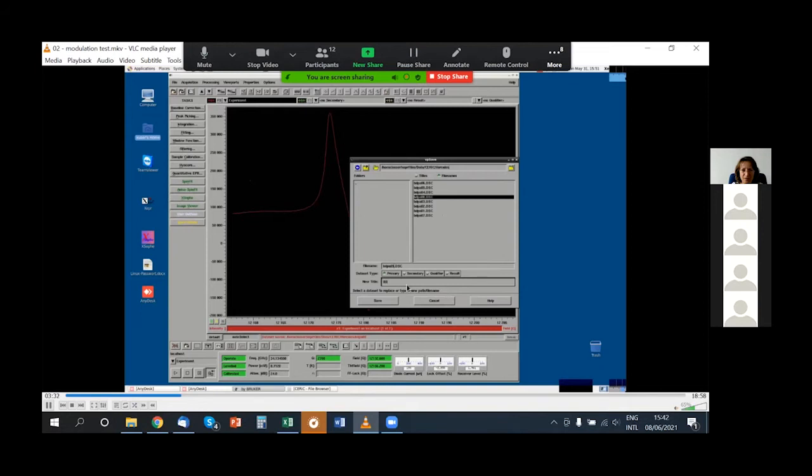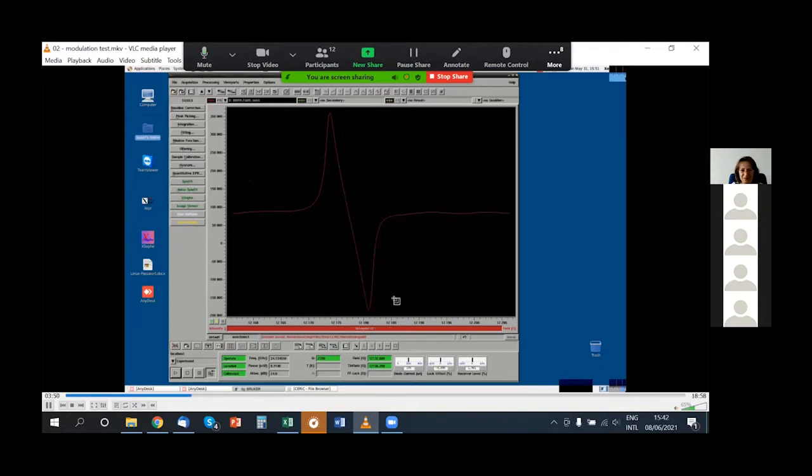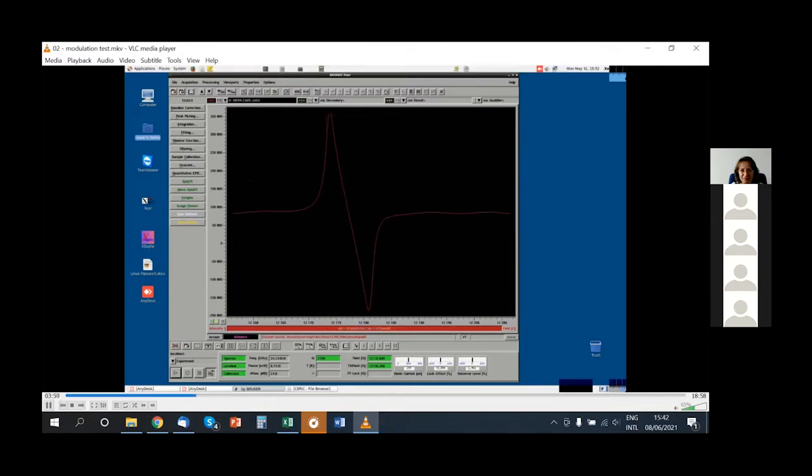I hope you see the colors on the screen. They are not very intense.